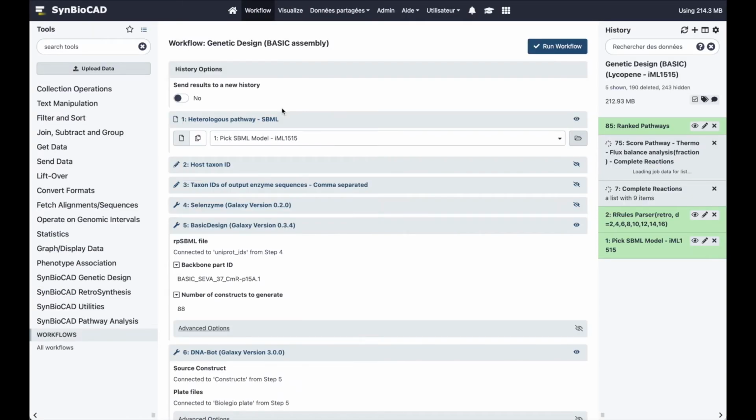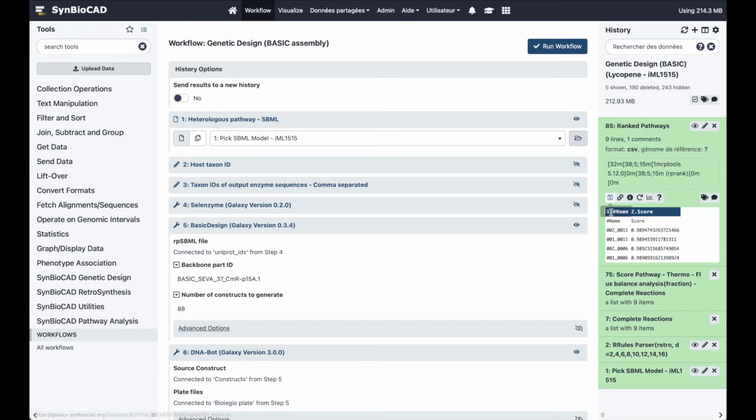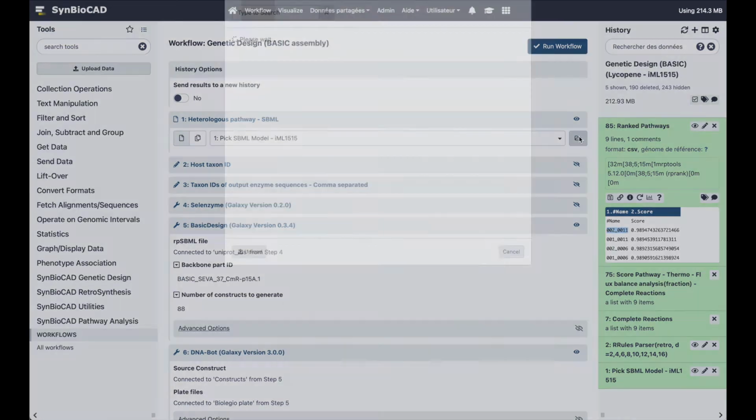Okay, now we can set inputs for the workflow. The first input is the metabolic pathway one wishes to design. The retrosynthesis workflow produces several pathways, but the pathway analysis workflow scored them. Then, it's easy to get the pathway with the best score.